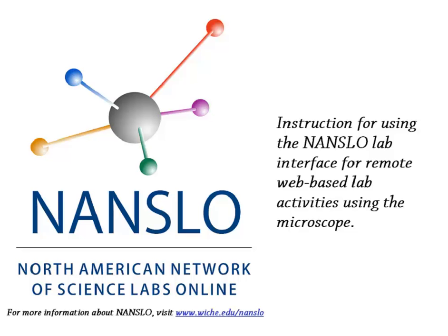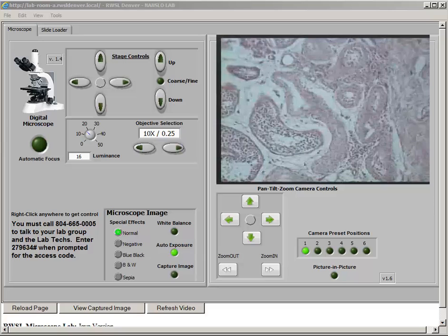The following are instructions for using the NANSLO lab interface for remote web-based lab activities using the microscope. The equipment control software shown here is written using the LabVIEW software from National Instruments. The user interface is presented as a LabVIEW front panel, which will be referred to as the lab interface for the remainder of this training.